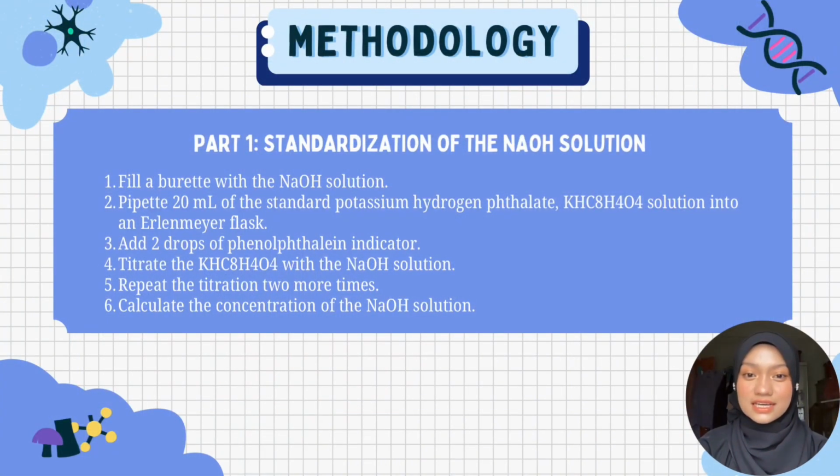Hello, my name is Nurtalika Anissa binti Muhammad Yunus. I am going to talk about the procedure of this experiment. The first part is standardization of sodium hydroxide solution.